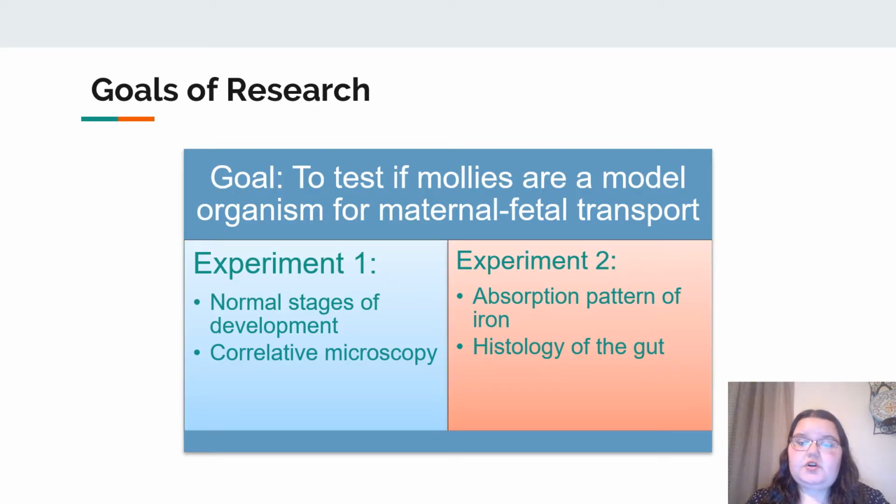So the overall goal of my research was to see if mollies are model organisms for maternal-fetal transport. And so the first step we needed to take to be able to do this was to classify the normal stages of development for mollies. And to do this, we used correlative microscopy techniques. And in the next slide, I'll go over some of these techniques that we used.